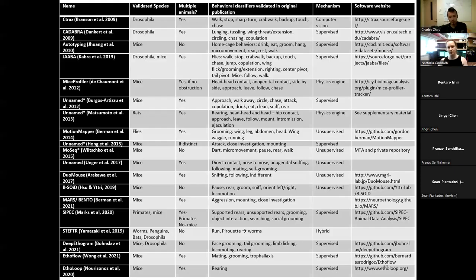So basically the way that we approach features, we tried to make as exhaustive a feature set as we could. And then we're trusting the random forest to go through and parse out the things that it needs versus doesn't. If you want to, especially for real-time applications, you can do dimensionality reduction, look at collinearity, really parse that down and say, we don't need movement over the last 250 and 200 milliseconds. That's redundant. We don't need it. So what we did is for the 2 mouse, 7 points per mouse set, I just used the default 500 features, and that has worked really well for me.